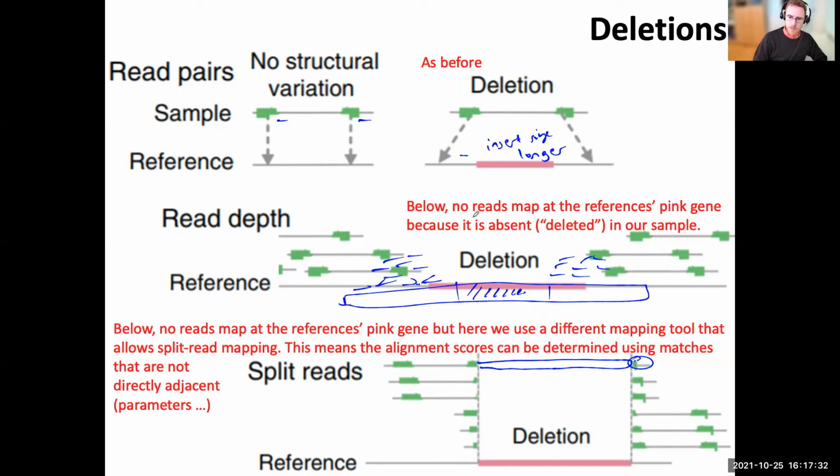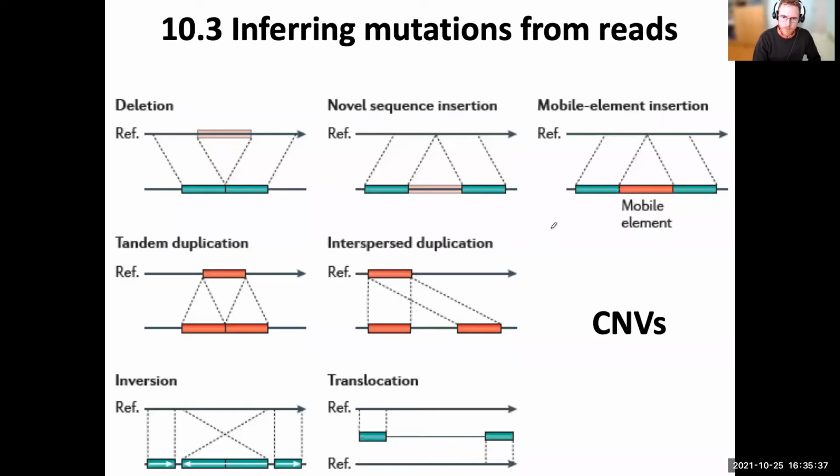If we have deletion, we'll see something like that. Okay, so when we have a deletion, we saw that the insert size in our sample is changed when we map to the reference, that is much longer. When we have an insertion in our sample, we find that the insert size becomes much smaller in addition to the breakpoint observations. And it's the same for an MGE as well.